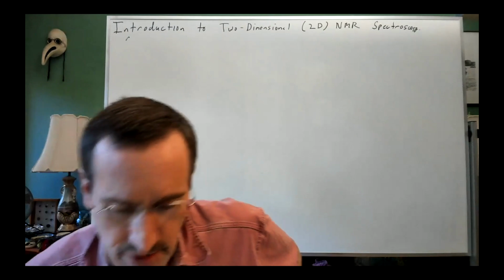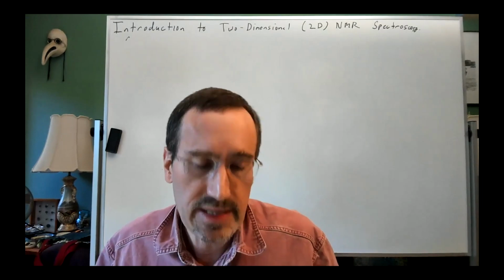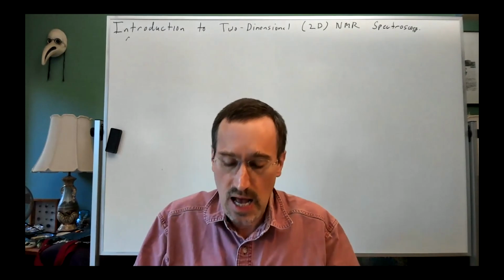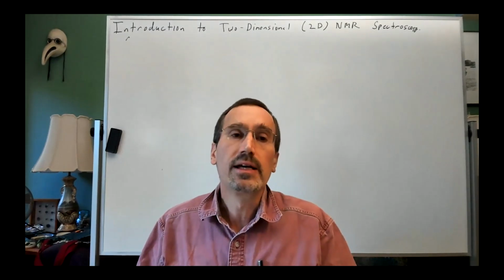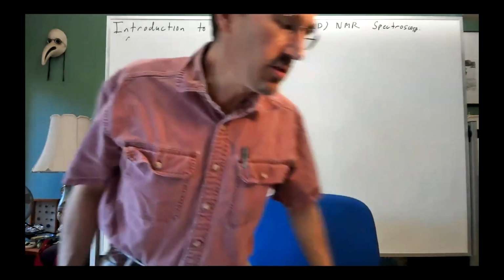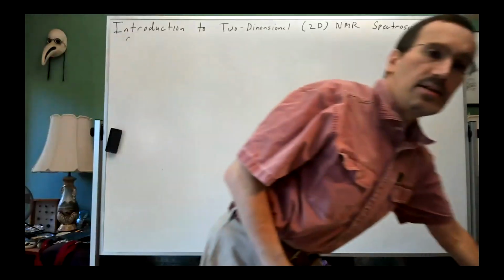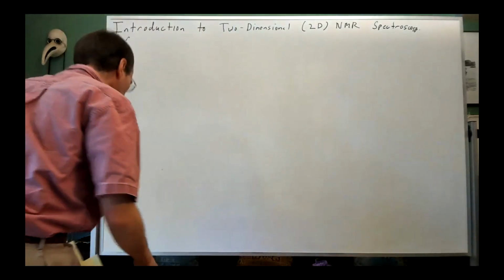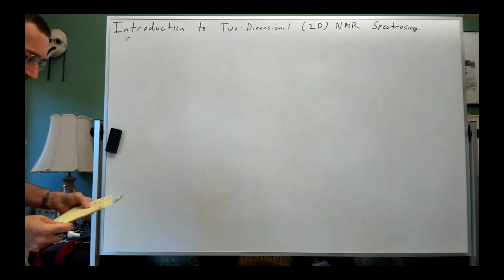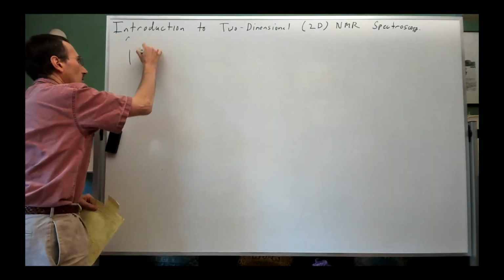We're getting ready for our first homework set that introduces 2D NMR. And I wanted us really to get a mastery of other techniques before we started to introduce 2D NMR into our toolbox. And so today what I'd like to do is an introduction to 2D NMR spectroscopy and talk about the principles and some of the basic experiments.